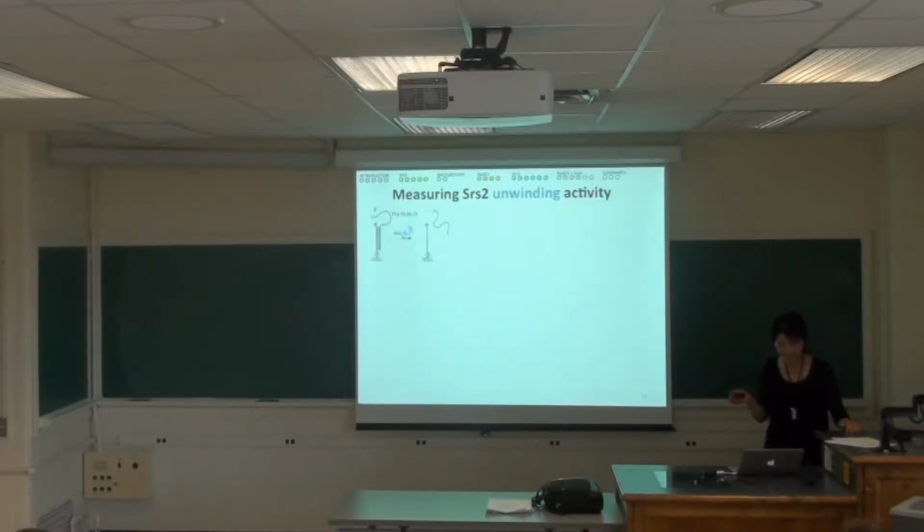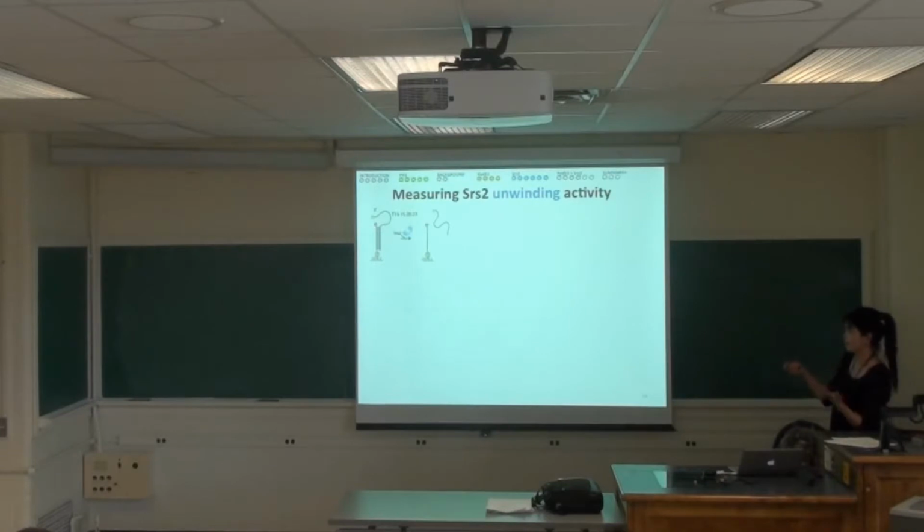And then now, this is the helicase activity, the unwinding activity. As I alluded to, this activity requires about 15 nanomolar protein concentration. So when you add that much protein, it unwinds. Okay, so that's what we did. Again, the same substrate. In this case, we are expecting to see the loss of this strand if it completes unwinding, right? If it unzips the two strands, this should disappear because the other strand is the one that's biotinylated, so that remains bound, and the other strand should be removed.